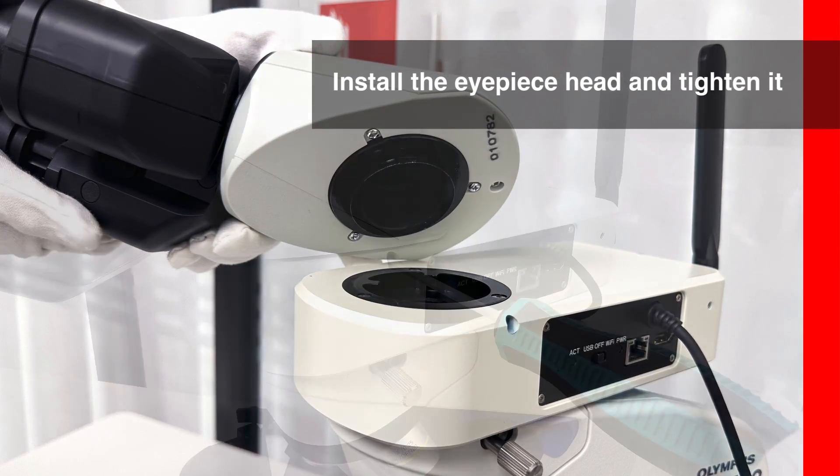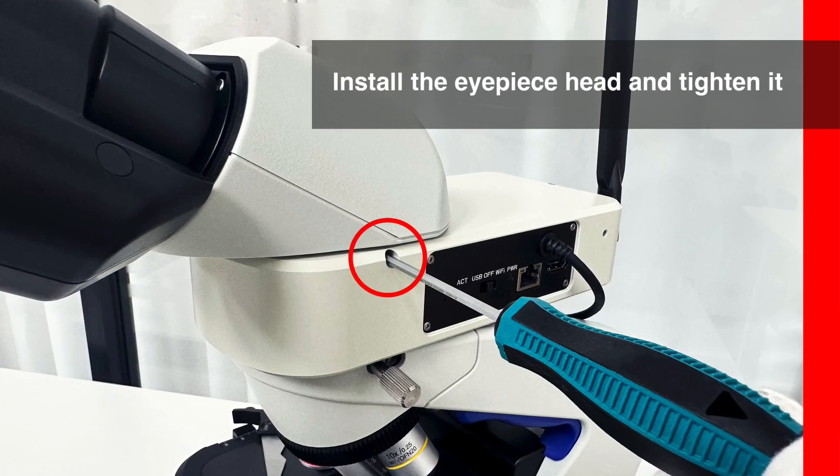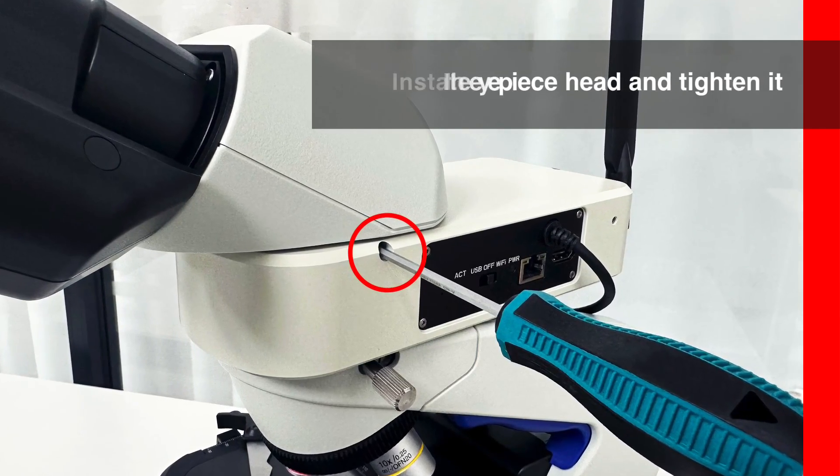Then we use a 3-millimeter allen key to attach the eyepiece head of the Olympus CX23.